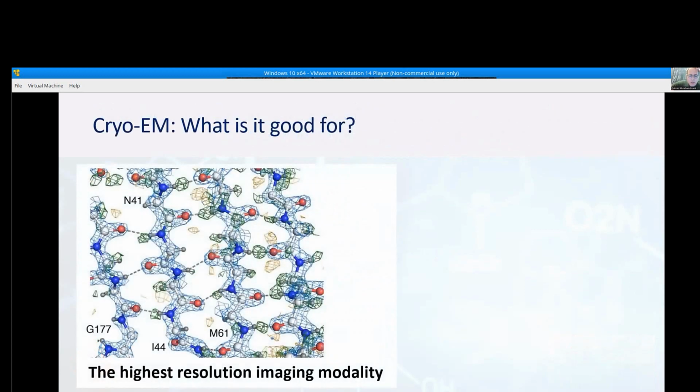And in cryo-EM, this question is very, very crucial, since I will show the pitfalls of the technique in a second and how we arrived at our molecular structures, but I will first give a short introduction to what cryo-EM is. Today, cryo-EM is the highest resolution imaging modality that humanity has. For any molecular structure that we would like to really see, to watch with our eyes and image, the only tool available to us today for getting to atomic resolution while imaging is cryo-EM.